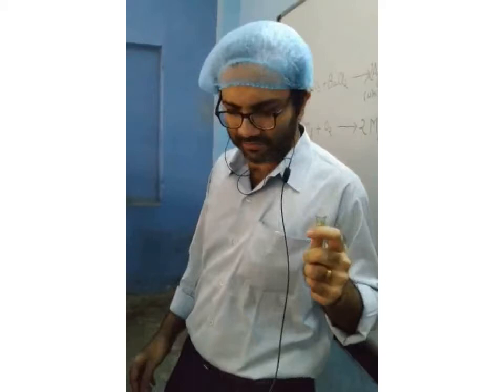You have seen that the transparent solution later gave a light blue precipitate with copper sulfate, and with ammonium hydroxide and ferrous sulfate, a dirty green precipitate formed. One thing which comes to our mind is how the reaction proceeds and what the reactions involved in this particular experiment are.